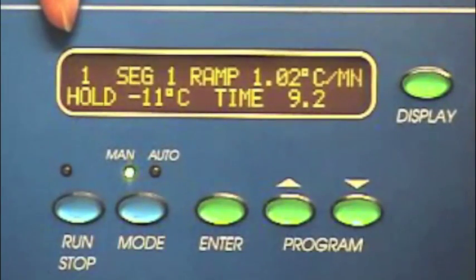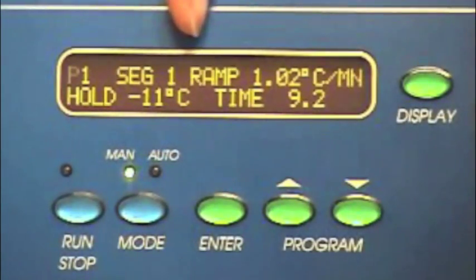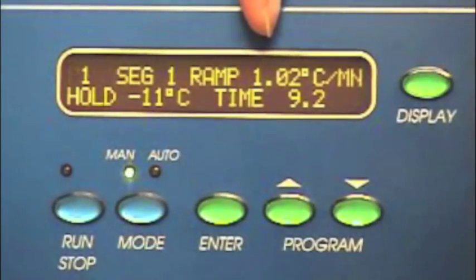The display shows the following parameters. P represents the program number. There are five segments. The first segment is always pre-freeze.